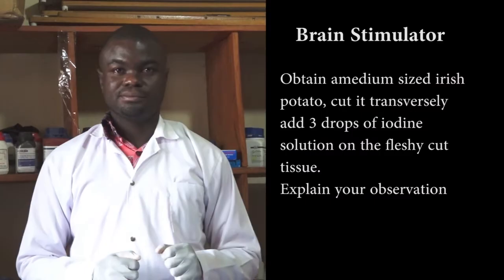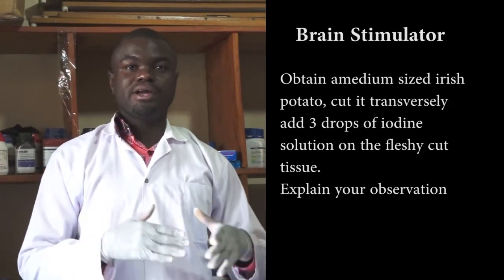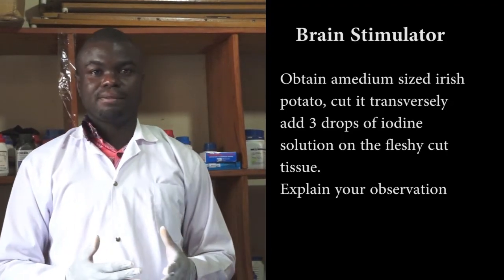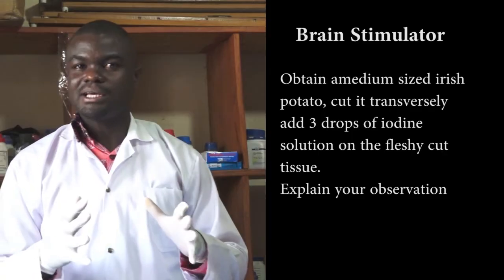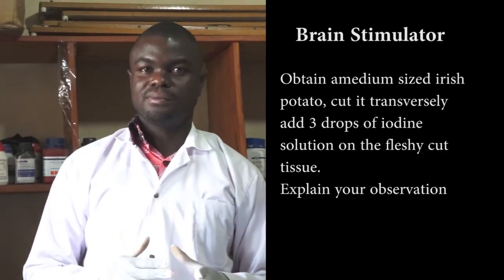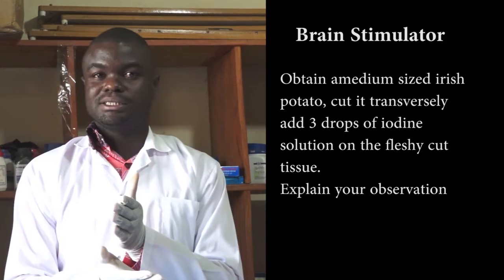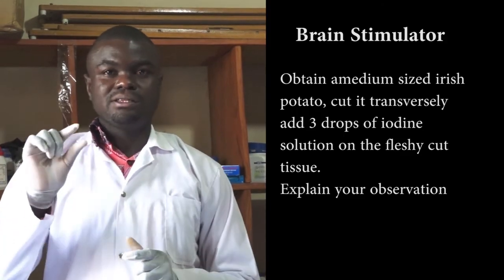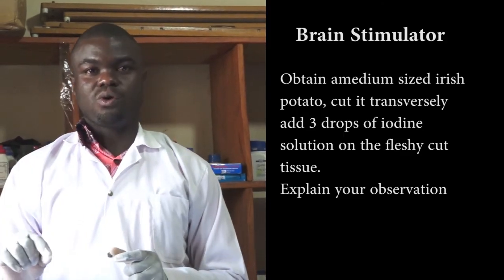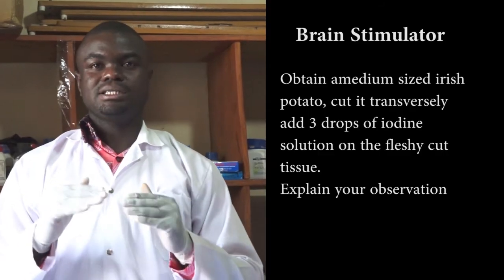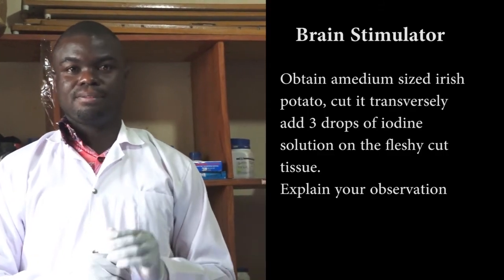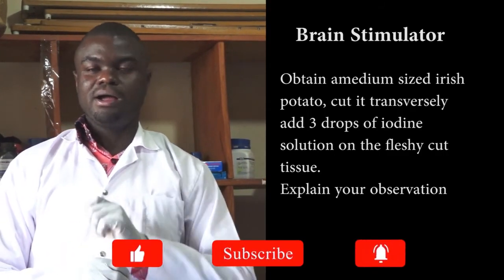So here is your brain teaser or one can call it a brain stimulator. Obtain a medium-sized Irish potato, cut it transversely, and add three drops of iodine solution on the flesh cut tissue. Explain your observation.